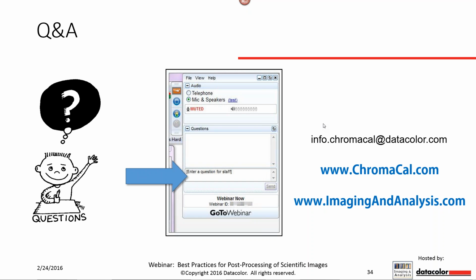That's a great question. Thank you. We've designed Easy Image Prep to be a very value-add process. So we've priced it to be a flat one-time fee of $349. There are no monthly fees. There are no annual fees. You get upgrades as well as any maintenance releases as they occur. Anytime you open up the software, it checks for the latest release and allows you to download it.